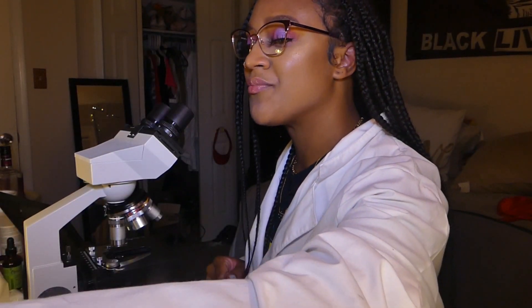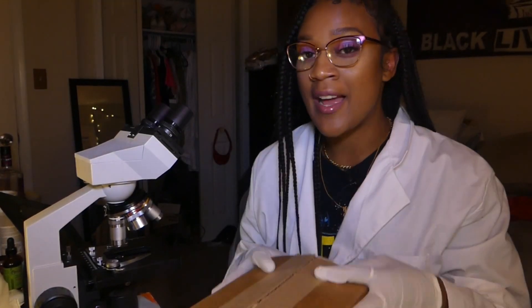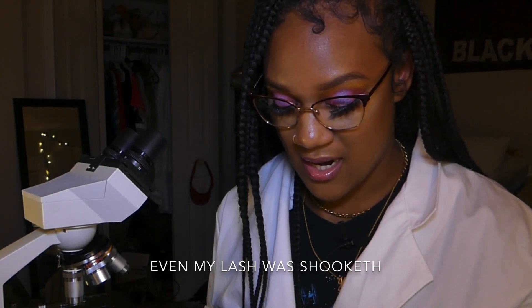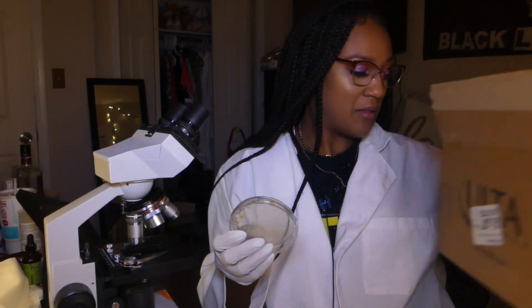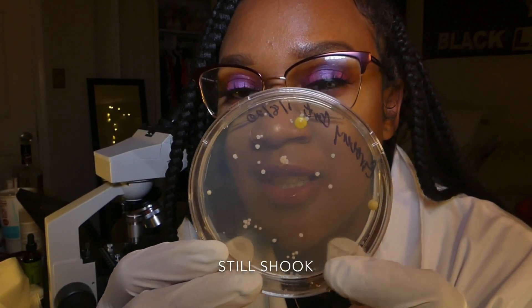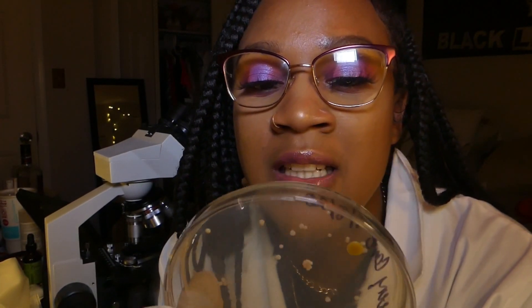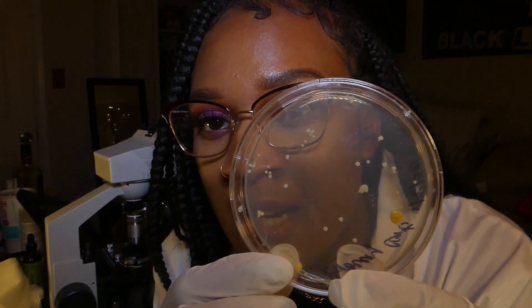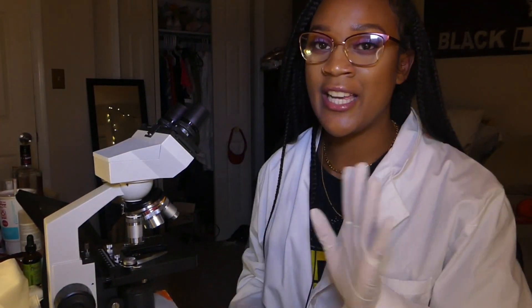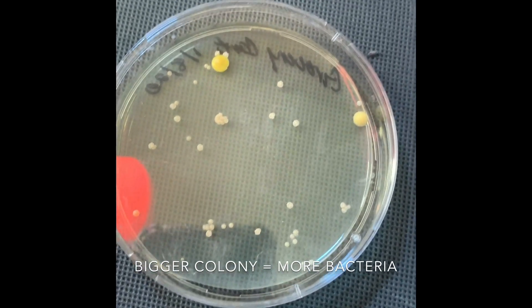I have my lab coat on, glasses on, and gloves on — don't nobody got time not to have PPE. I have the box here with all my agar plates inside. This is the grocery cart plate. You can see these circles or dots — each dot is a bacterial colony. They're all different sizes; this one is kind of yellow. Just to give some perspective: one visible colony equals one million bacteria.